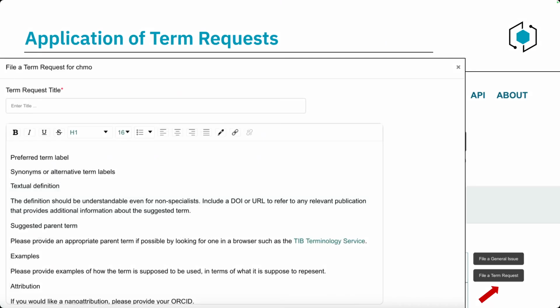We are going to try this for the UV-Vis MIChI. We'll still see how things could work out, how fast they are, and so on. But we believe we need more collaboration with ontology providers, so that we could make things faster. Maybe simply by giving high priority to issues related to MIChI. And hopefully we could report about this next year. And that's it, actually. Thank you very much.